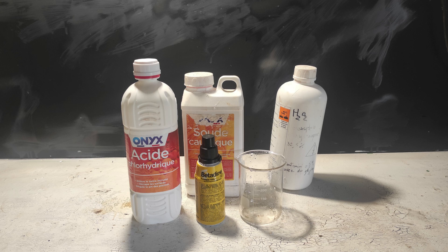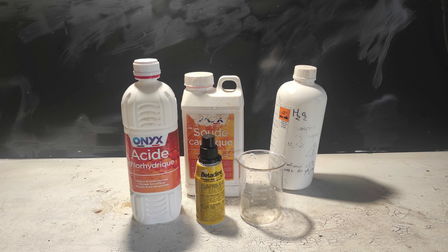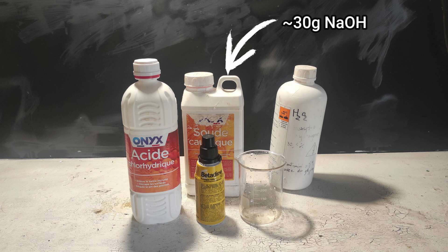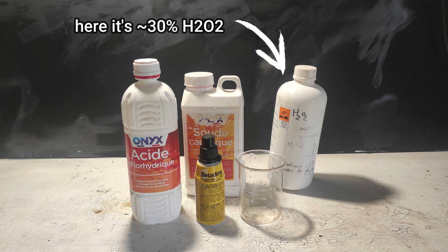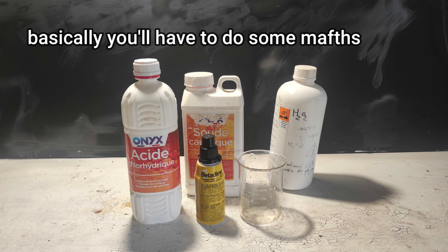Let's take a look at the reagents needed to do this procedure. Of course you need a 10% betadine solution as an iodine source, but any other concentration or even iodine tincture will work. Then you need around 100-150 ml of 23% hydrochloric acid, around 30 grams of sodium hydroxide, and finally hydrogen peroxide in any concentration. If you use a different concentration of reagents, be aware that you'll need to adapt the quantities required.